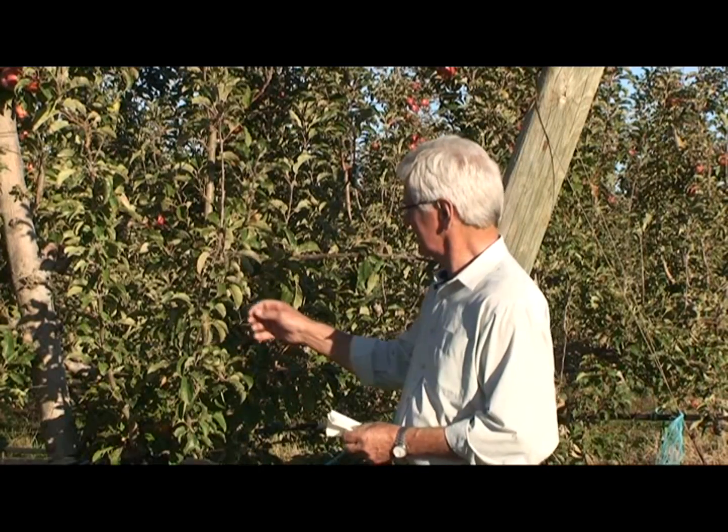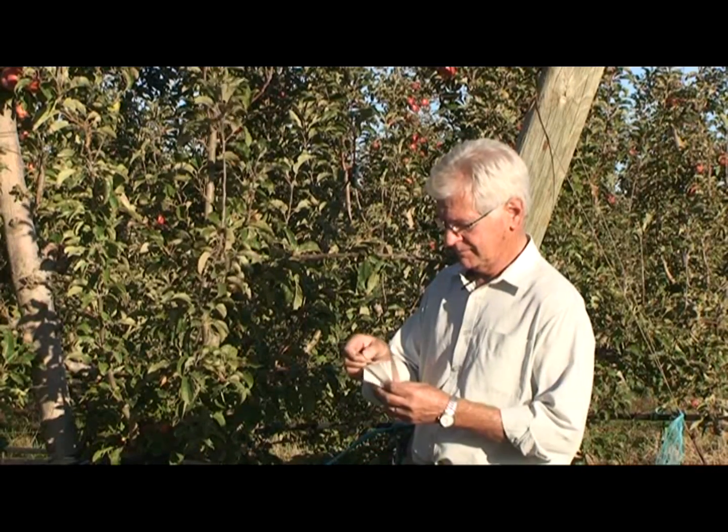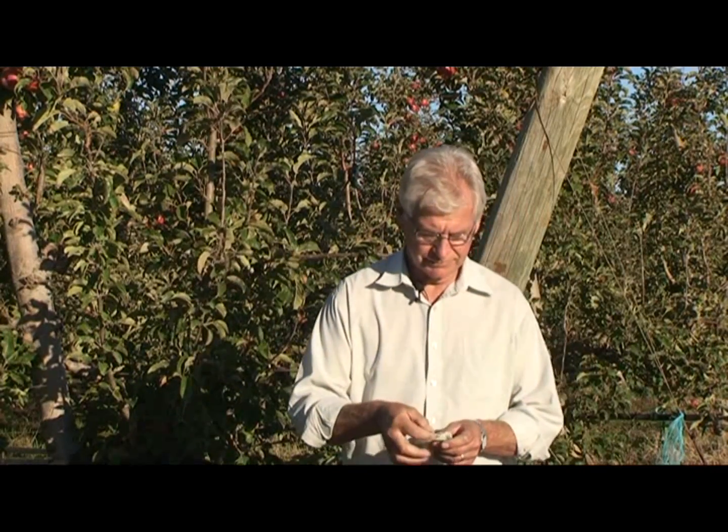The first thing we need to do is to take a leaf sample from the tree and wrap it in a wet tissue. Then we take the leaf sample to the instrument to measure the water status of the tree.